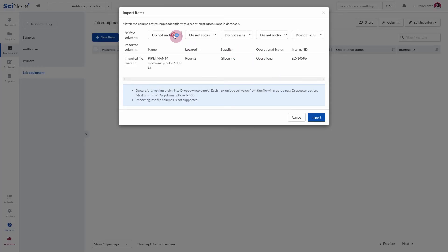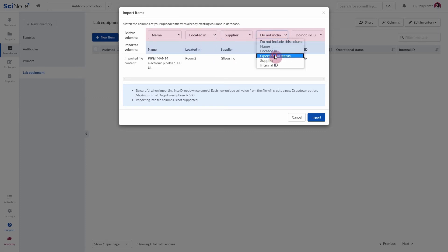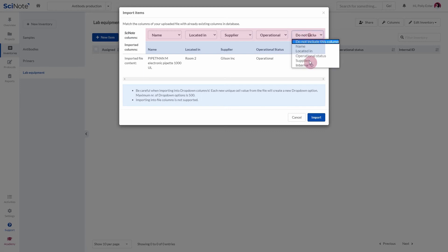Next, you have to match the columns of your uploaded file with the Name column and other columns you have created in your SciNote inventory. When you are done, click Import.